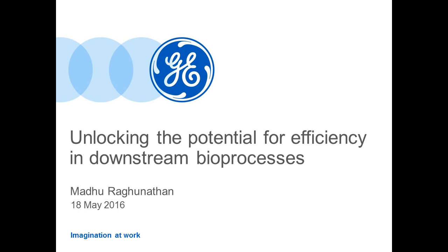So as opposed to that, when you can get your packing right the first time, and when you have an optimally packed bed that's actually stable over the number of cycles of operation that you want, that does have an impact on the life cycle of the resin, right? So I would say it definitely does have an impact on the life cycle of the resin. But it also depends on, what is your starting point? What is your packing failure rate?